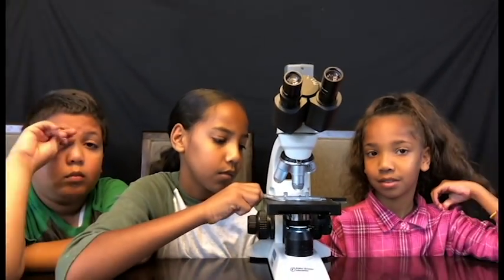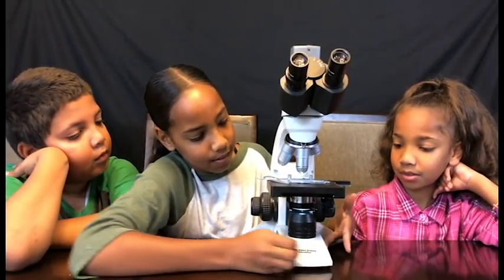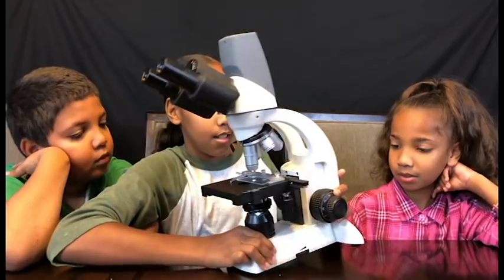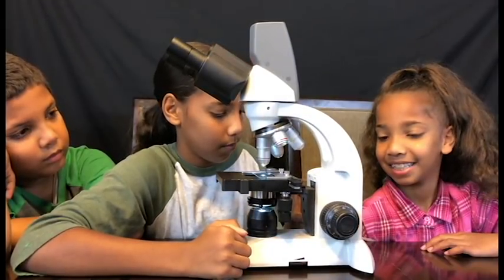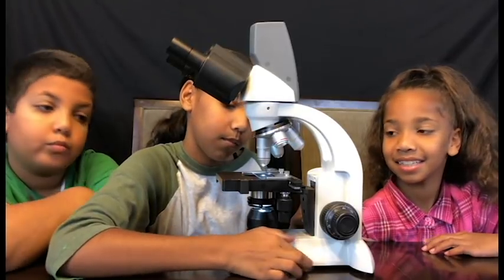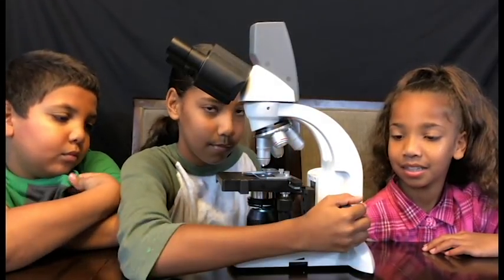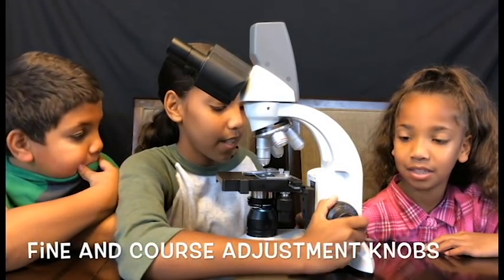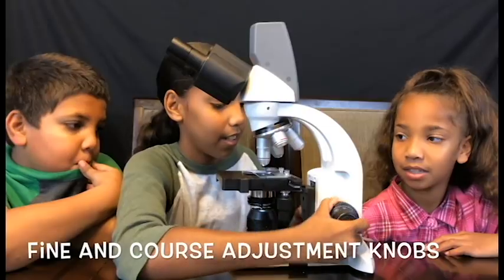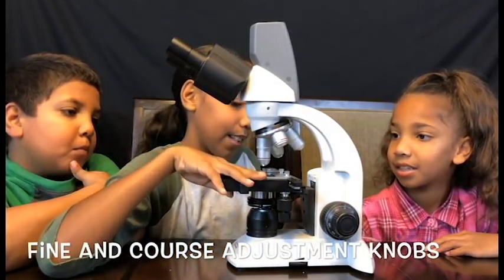So Jasmine, show me the light. There's a knob that can adjust how much light goes in and out — right here. So Jasmine, when we're trying to get the object focused, we use the adjustment knobs. Tell them about the two types of adjustment knobs. This is the fine adjustment, and then this is just the adjustment that adjusts how far it goes and things like that.